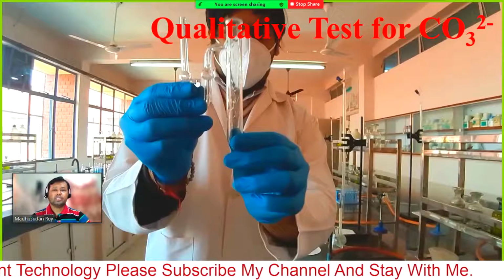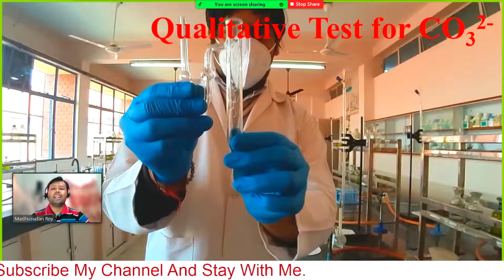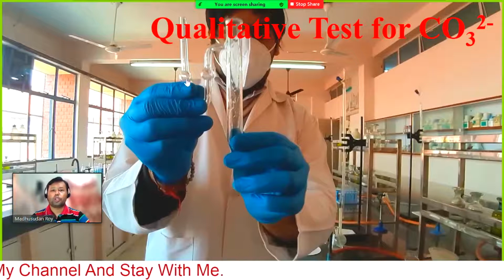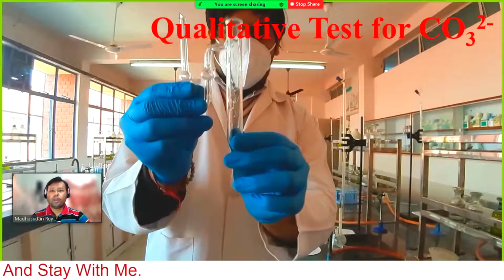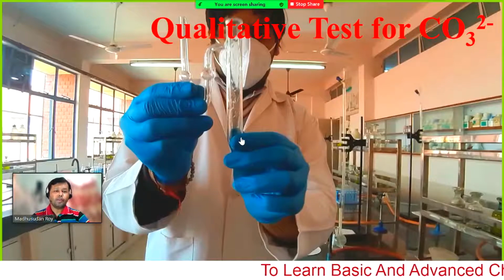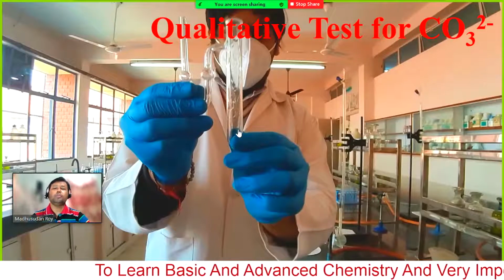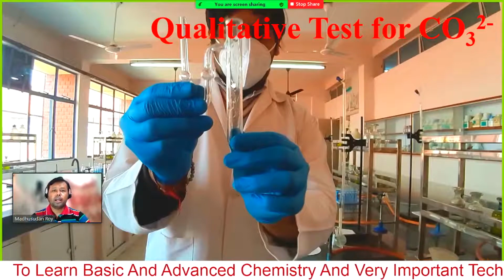So first you have to take the clear lime water in this bend portion. Take the lime water through this way, and then take the salt into the test tube, and then add HCl or sulfuric acid, that means some acid, into the test tube.